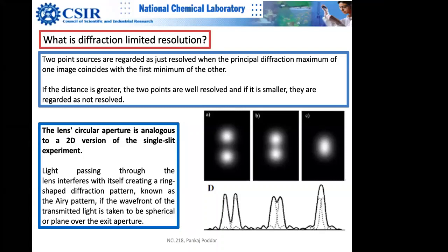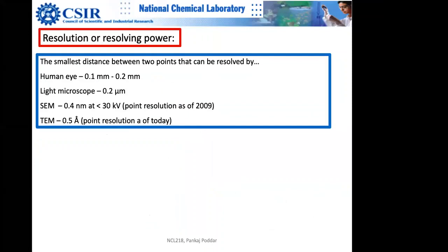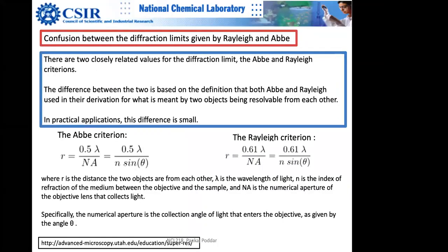So we are not discussing aberration limited, which is the main limit here, because see, our lambda is so small, we don't need to worry about diffraction limited resolution in an electron microscope. I told you that we are talking about picometers, right? Just put picometer as lambda here and you get the resolution. I mean, it's unbelievable. It's unachievable.